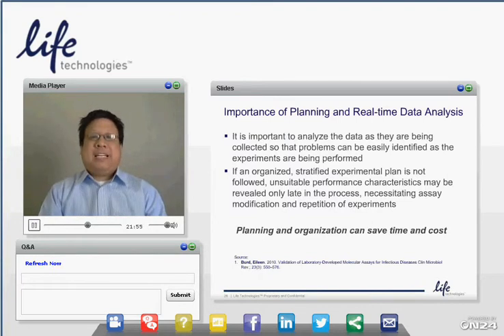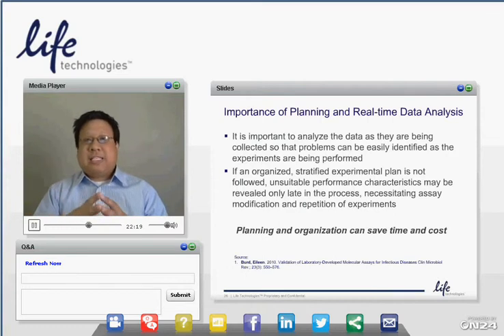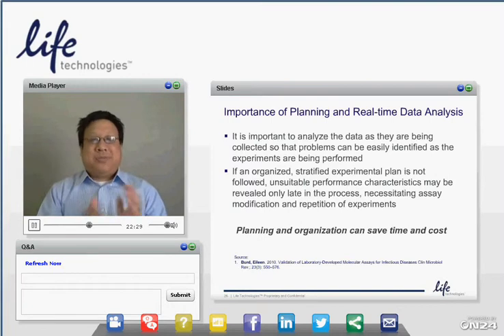So now we're moving into the third stage of the study, which is where we're running the study now. Just to let you know, one thing I want to talk about the software is that the software actually has hierarchical access. Whereas I know I mentioned the director, I mentioned during my talk the supervisor, also mentioned the operator/technician. These are different access levels for these users, and they have different responsibilities within the software.